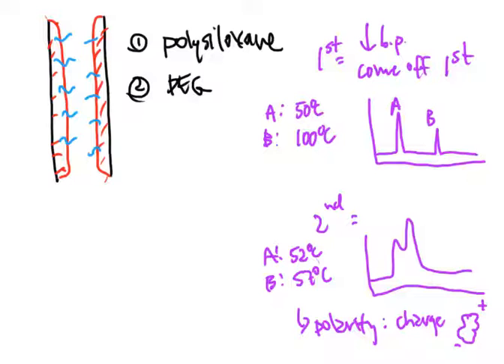and we can treat that like boiling point. And we can change a column up, and when we change the column up, what can happen is that maybe, just maybe, I can improve my chromatogram, and I don't need to see this mess. Maybe by changing the column up, I can then get a clear separation of the two components. And that's why there are so many choices out there, because there are so many things that we have to analyze, and we need those choices available to me. That way I can order what is best suited for your purpose.